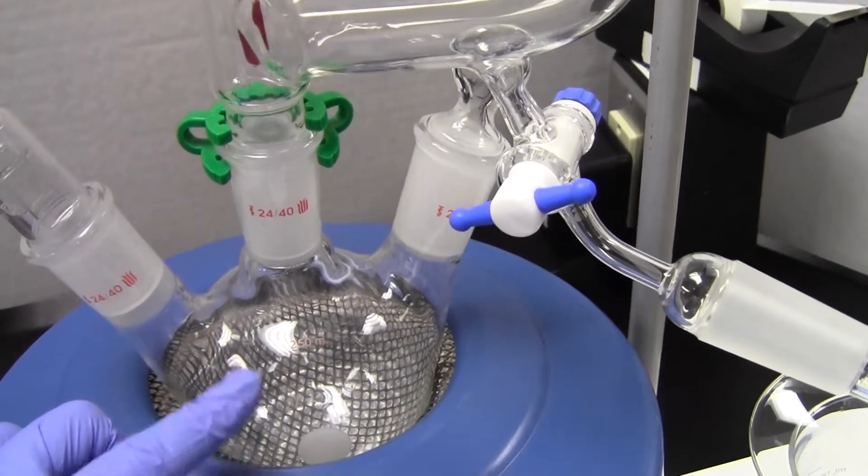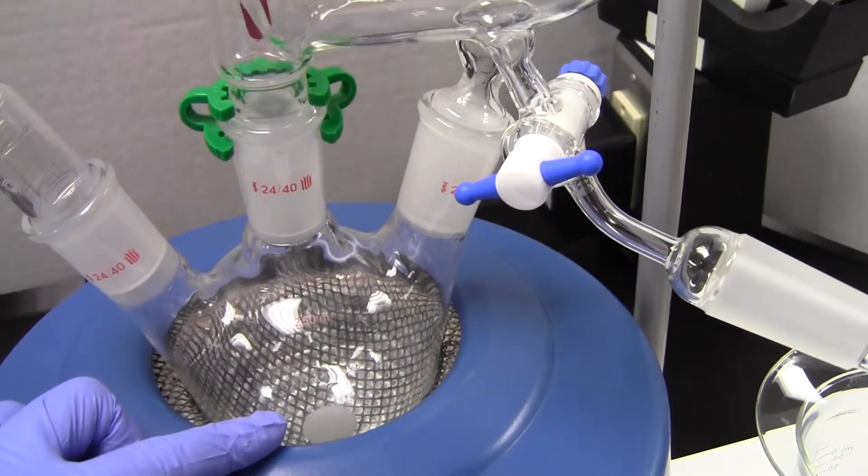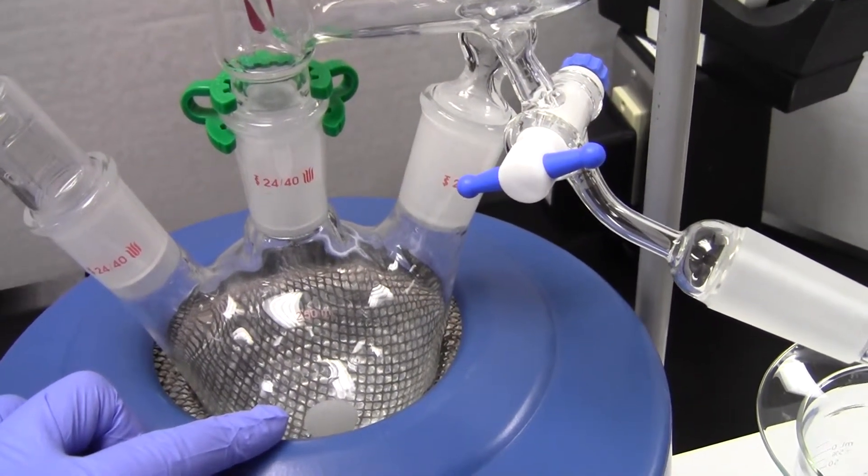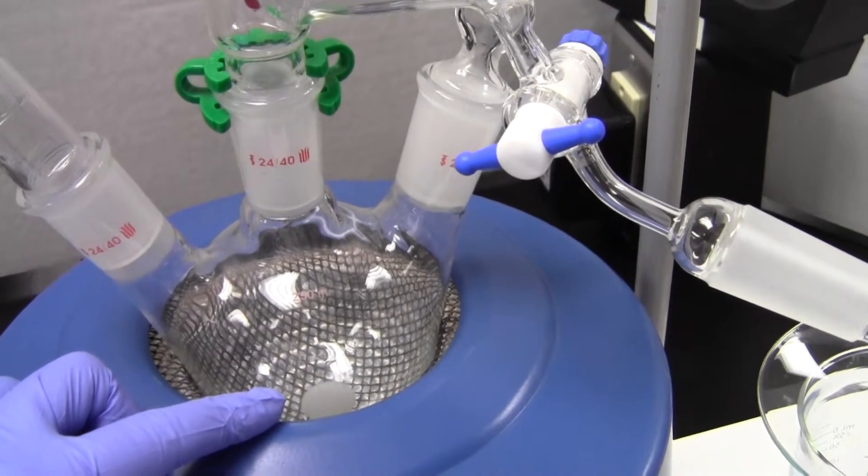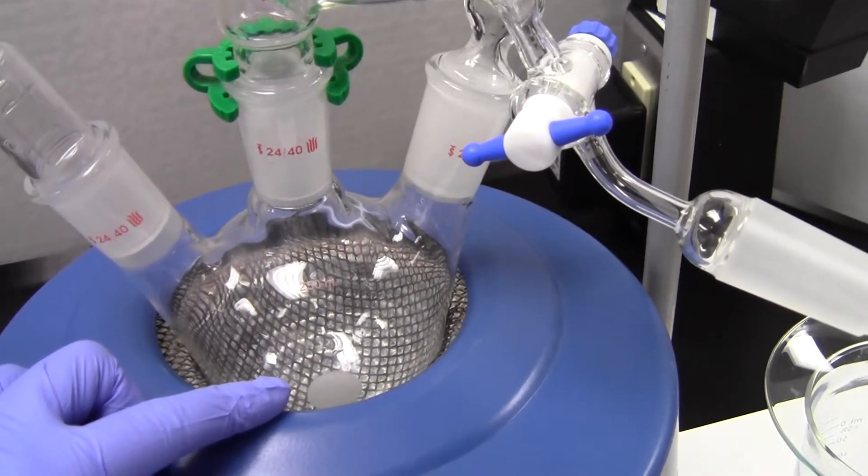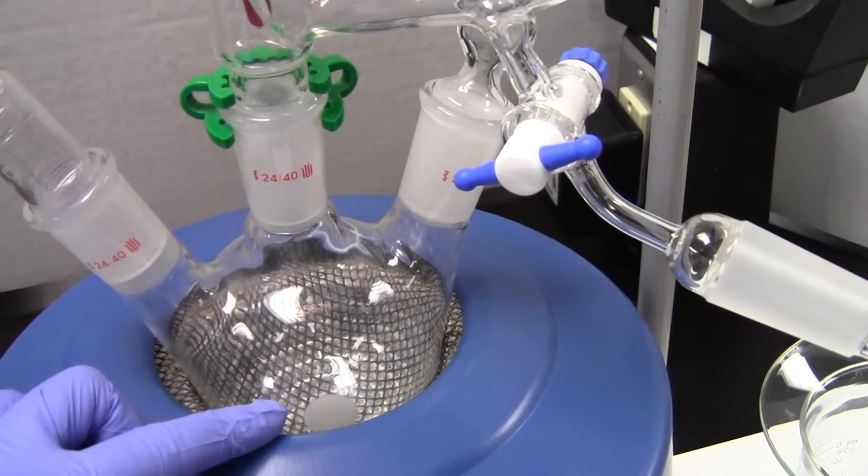It should stop boiling when you add the cold cyclohexane, then it'll re-establish. You want to aim for your temperature to drop by a degree or two, but not more than that, so make some careful additions.